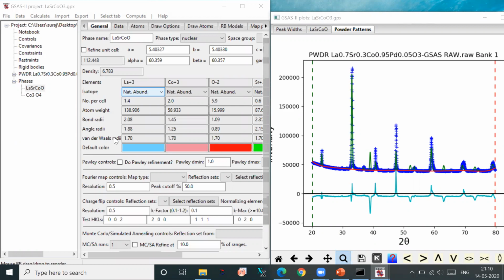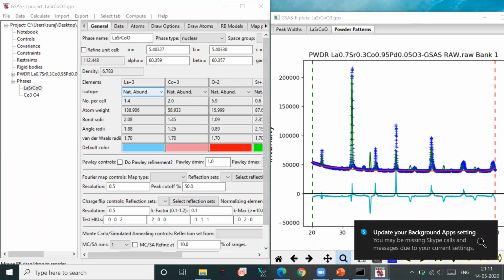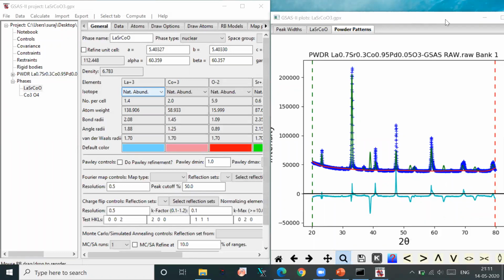After next week, when you explain about Vesta and the important things, also cover the weight fraction of phase 2, and maybe phase 3 can also be there. As you said, palladium oxide is there, so different phases can be put in, but there are a lot of other things also. So next week also say something about this. It may not be too lengthy, but somewhat it should be there.